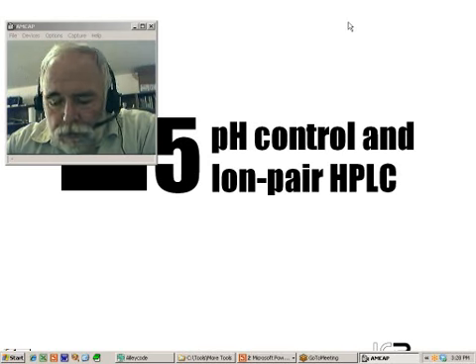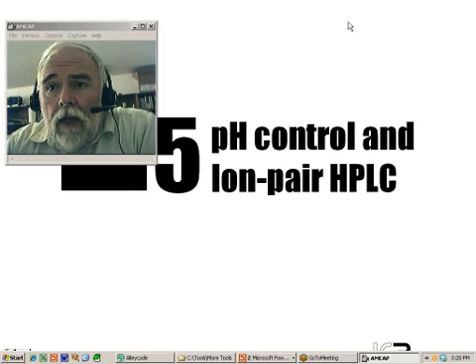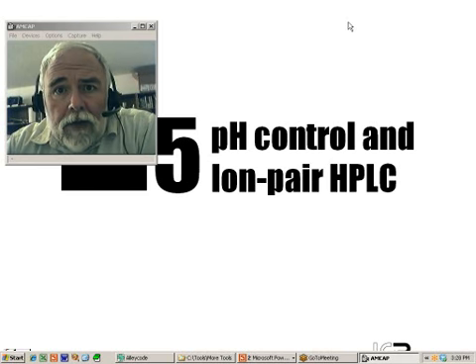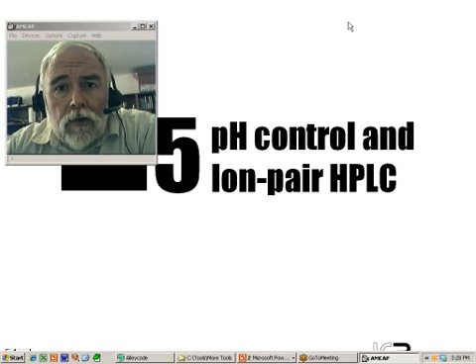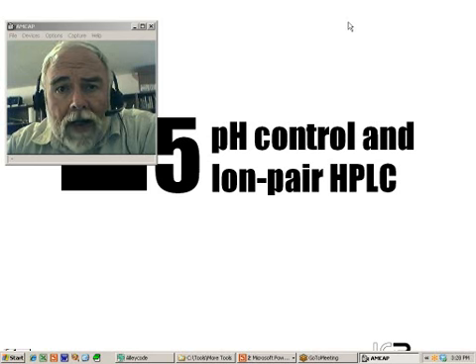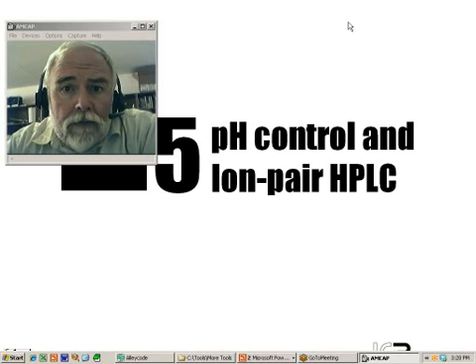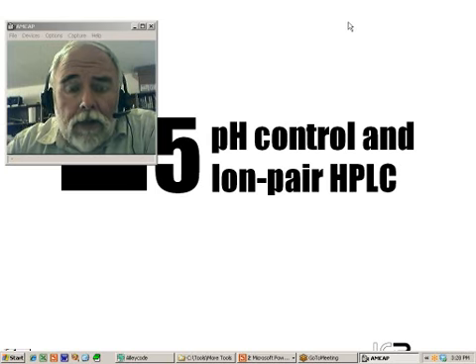I'm Tom Jupil, the administrator and moderator of Chromatography Forum. Over the past several months, there have been a number of posts dealing with questions about pH and reverse phase chromatography. And so what I've done here is pulled sort of an outtake from our HPLC Basics Equipment and Troubleshooting course that provides a basic overview of how pH works and what the influence of pH on retention in reverse phase chromatography is going to be.